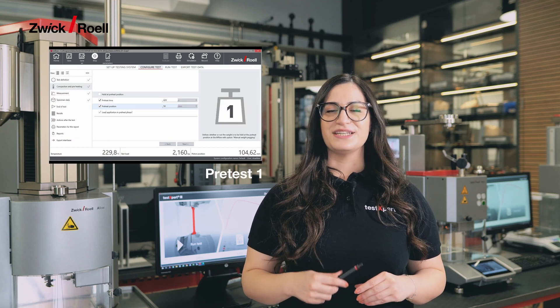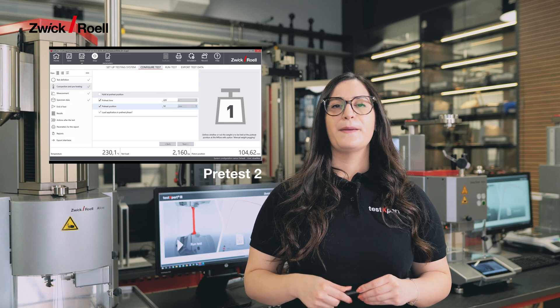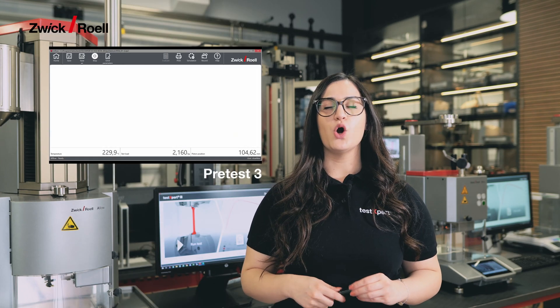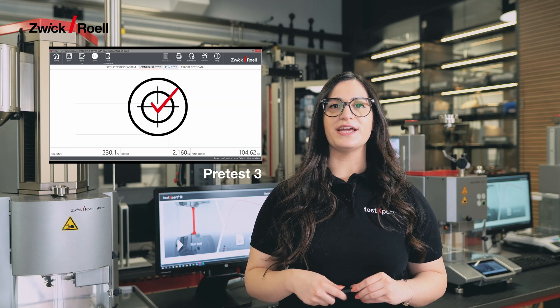Please note that pre-testing is necessary to ensure accurate control when testing new polymers. Then only once pre-testing is complete, you can configure and start the test.